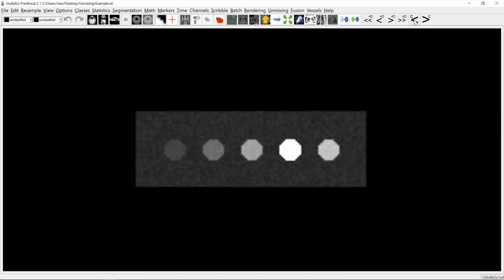These are the 4 channels, and go back. And the wells contain 2 substances, A and B, and it has here 100% of A in here, and then 0% of A, and in the middle it's 75, 50 and 25%. And for B it's a bit more complicated, but I'll explain that later.